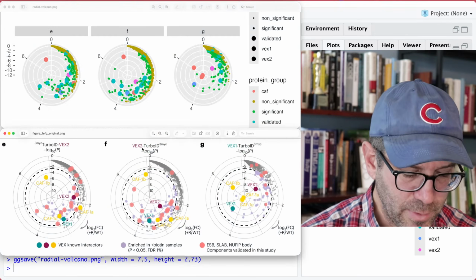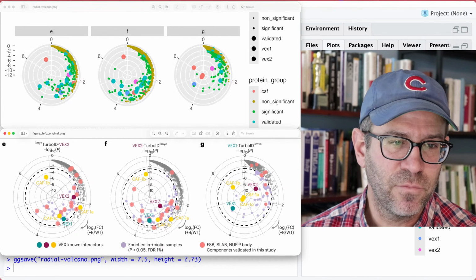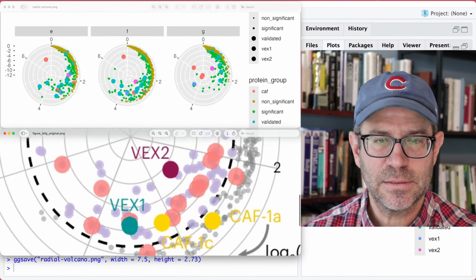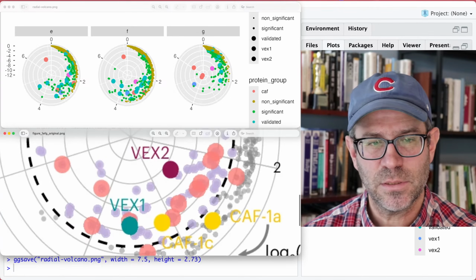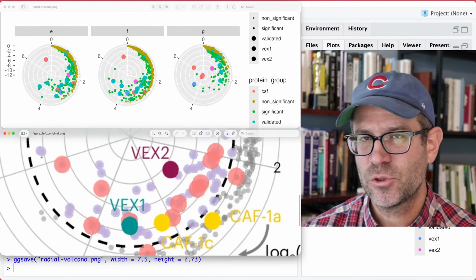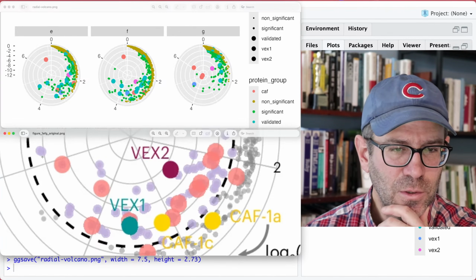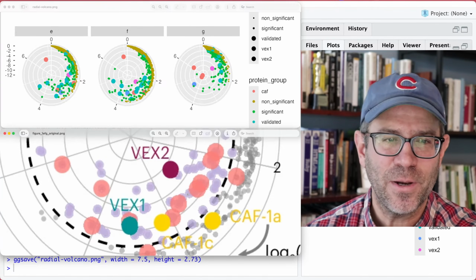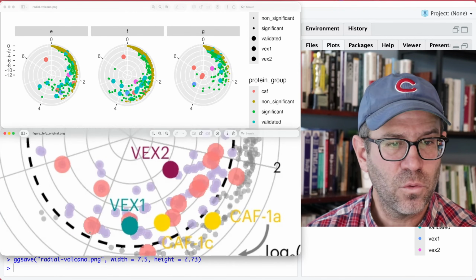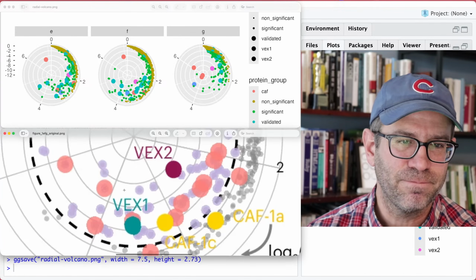And you know what? I'm thinking about this, and one of the things that I commented on in the critique video is that for some of these, like in the original, it's a bit hard to see the boundaries on some of these points, right? Like this over here, it's 2 purple dots kind of close to each other. And so we want to get rid of that. The other thing I'll point out is that in the critique video, I also commented on how they had an alpha for the purple and the pink and the gray. I don't want to do that just because I don't think it is attractive.